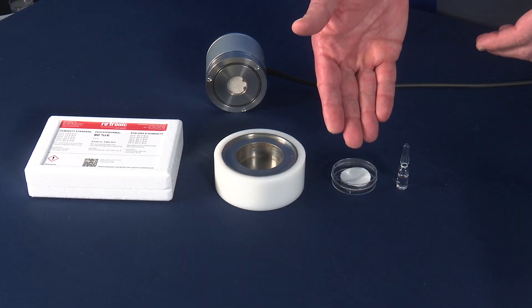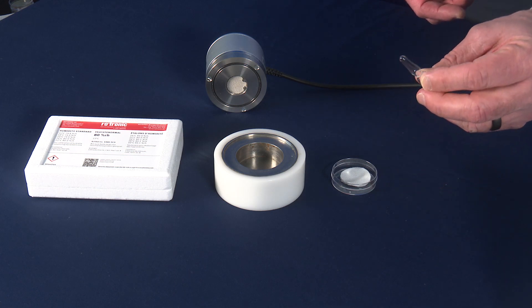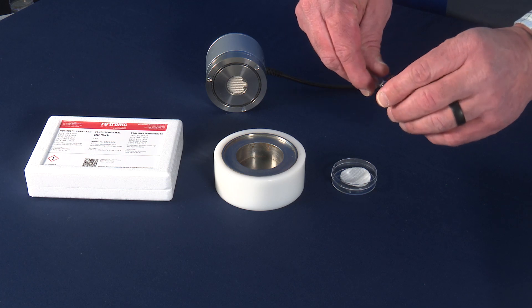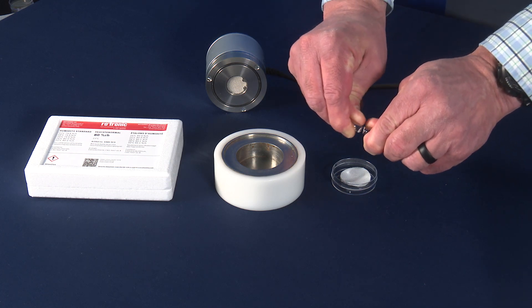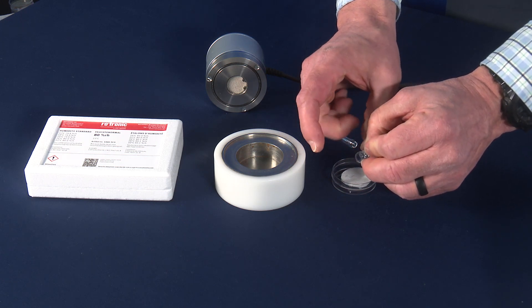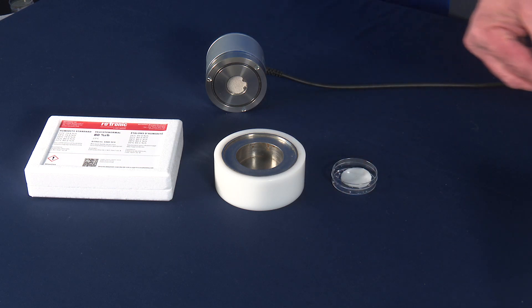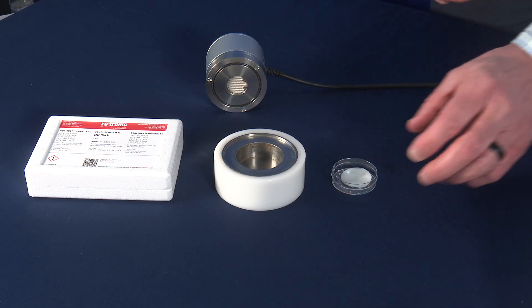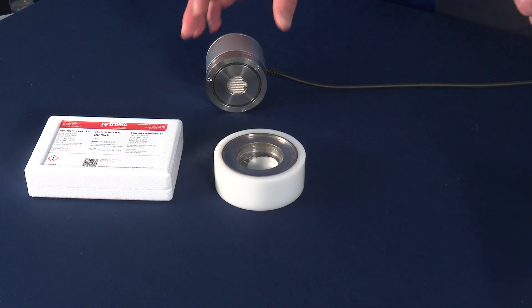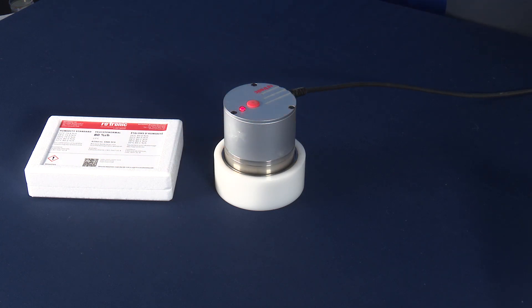We want to start with a fresh fiber disc pad. We have our next humidity standard — 80% RH. We've tapped the vial so the contents are at the bottom. Once again, at the perforation, carefully break the glass ampule and empty the contents onto the fiber disc pad. Once the full content has been emptied, carefully discard the glass vial, place the sample cup into the sample cup holder, and place the Rotronic Water Activity Probe onto the sample cup holder.